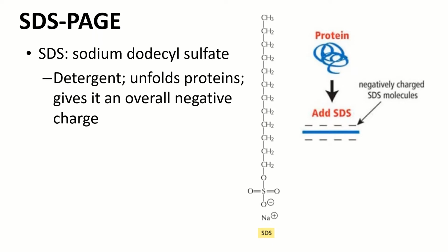Now the SDS part, the sodium dodecyl sulfate, it's actually a chemical that is a detergent. It functions as a detergent, meaning to say the molecule of this compound has a portion which is hydrophilic, and there's also a portion, this long tail here, that is hydrophobic. So take note, the proteins in our cells might be mostly embedded in the cell membrane, which is highly amphipathic in nature, and so are these proteins.